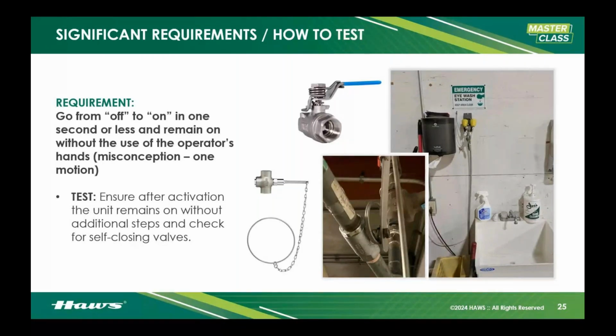Now, the other issue is the way it's mounted. You have to be careful, whether it's on the back of a counter, with the direction the eye face wash is facing. That has to be oriented towards the victim. We can't have it facing towards the wall like this. I can't activate it, let it go, dig my fingers into my eyelids and spread them open and use this. It's going to be impossible. So watch out for those types of units as well.